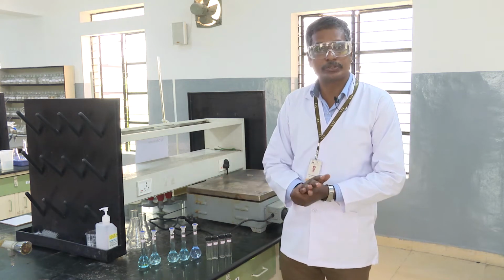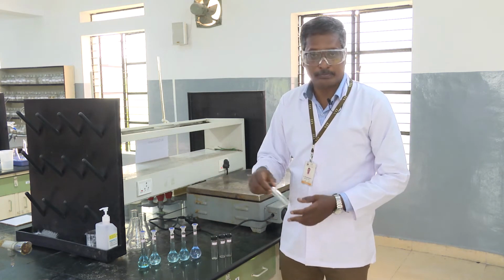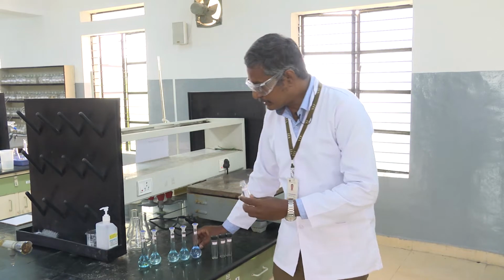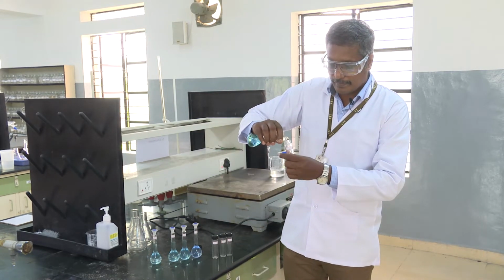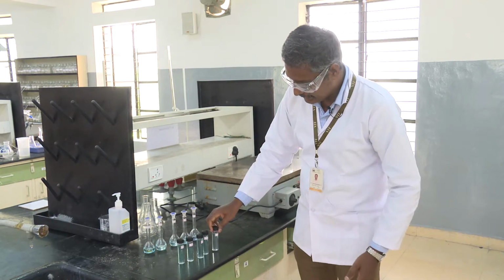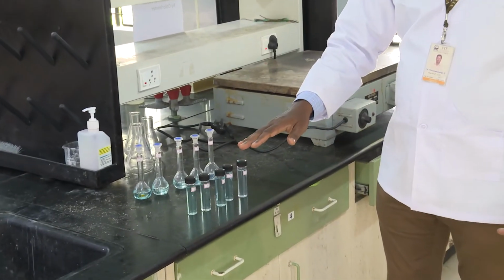Our next task is to transfer this solution into a tube. So we are going to use these labeled tubes. Transfer the first solution, which is labeled 1, to this one carefully. Now students, please carefully observe the color of the sample. We can see most of them have a similar color.